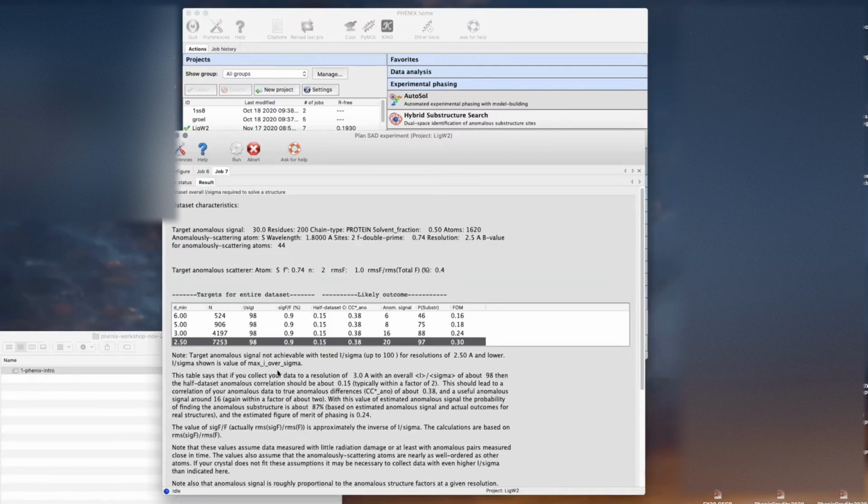That's pretty good. We're in pretty good shape in this particular case. Even though we don't have as much scattering, if we measure the data very accurately, that's going to work.